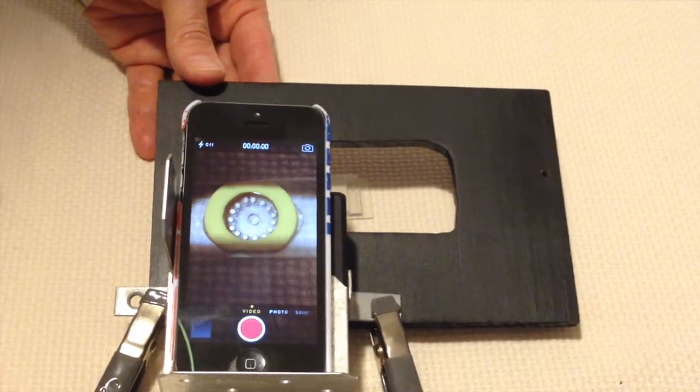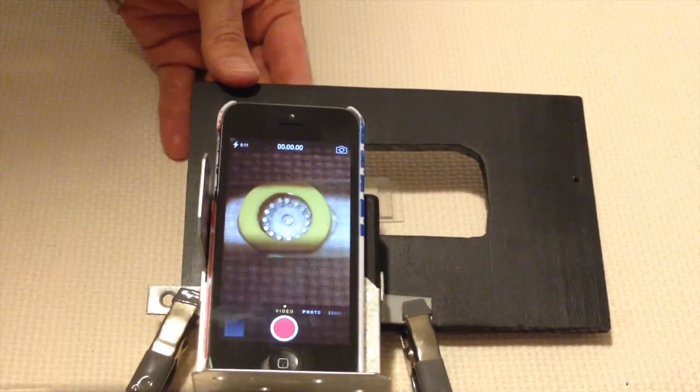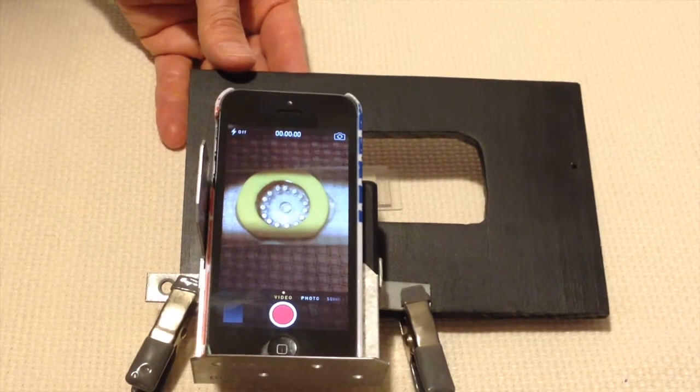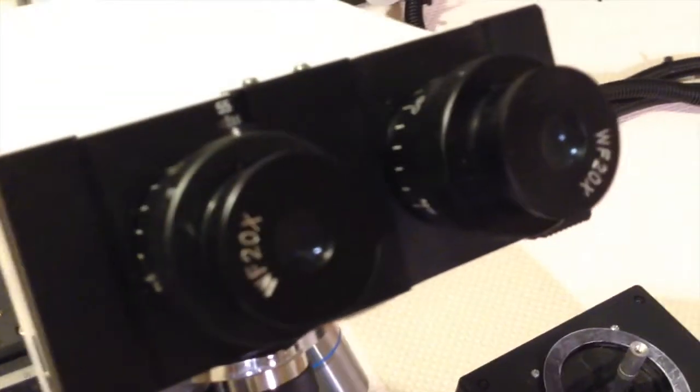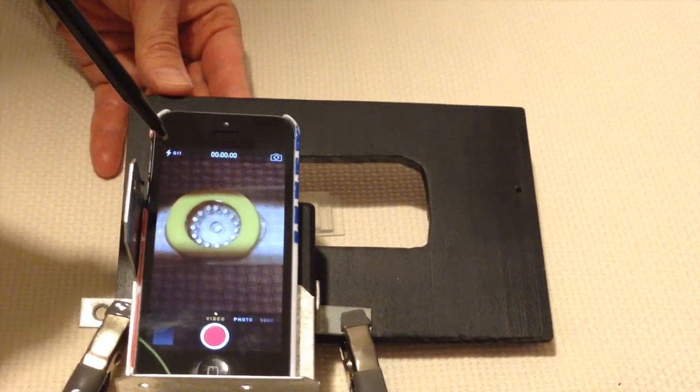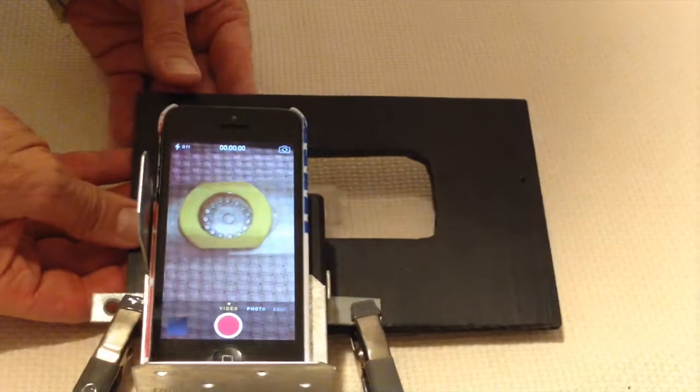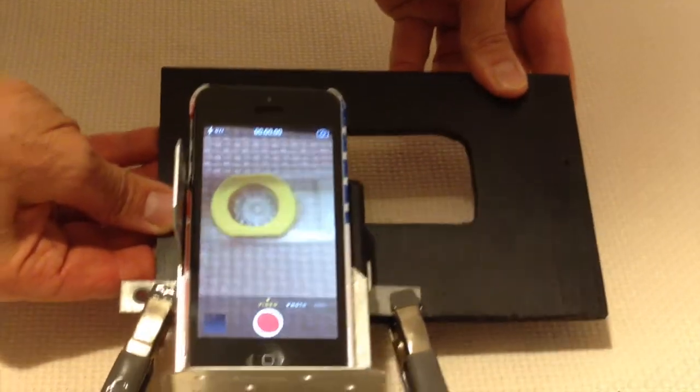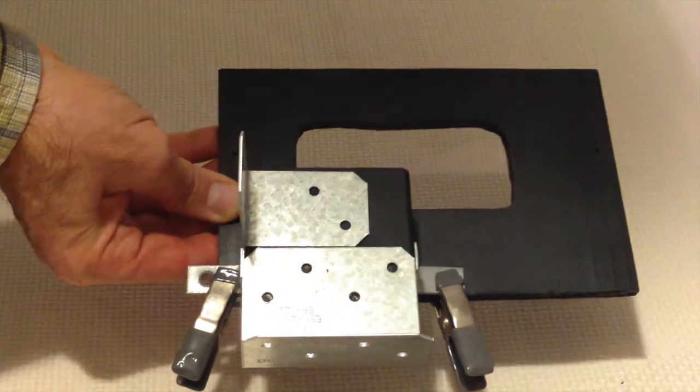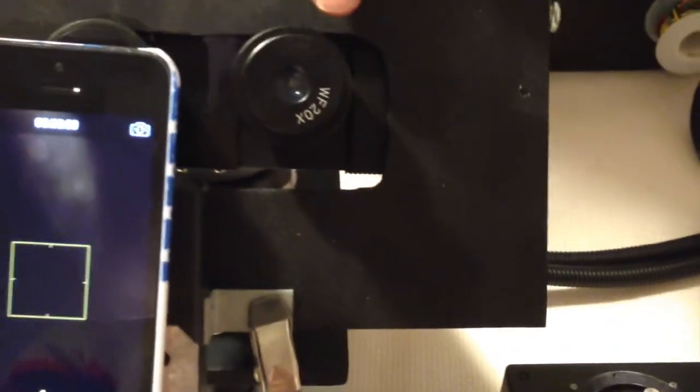What we have here is an adapter we made for the iPhone, the iPhone 5 actually, where we can clip this device with this holder to the front of the microscope. It actually just attaches with this little bungee cord. It works great to not only take pictures of our samples, but video, of course, too. The camera just pops in and out, and it actually still leaves the other eyepiece open so that the camera can go in one and you can look through the other. So it's very functional.